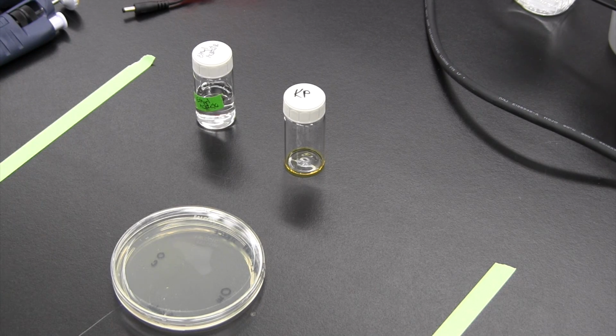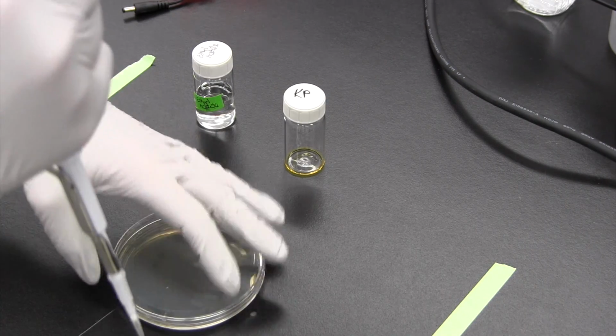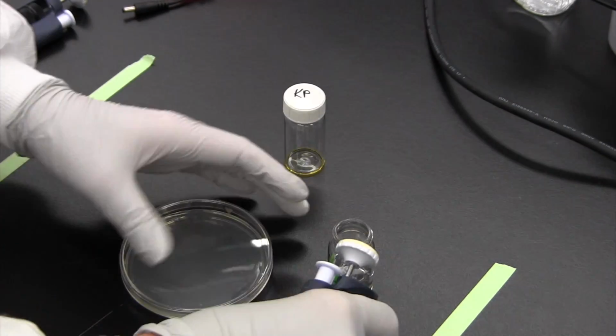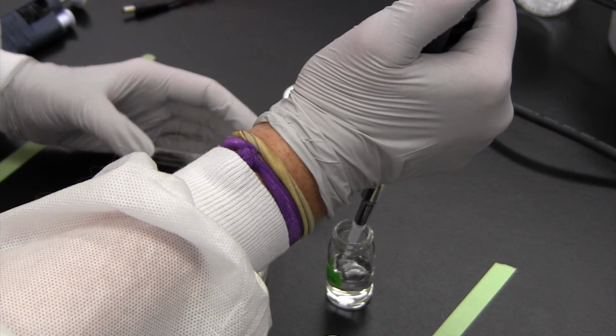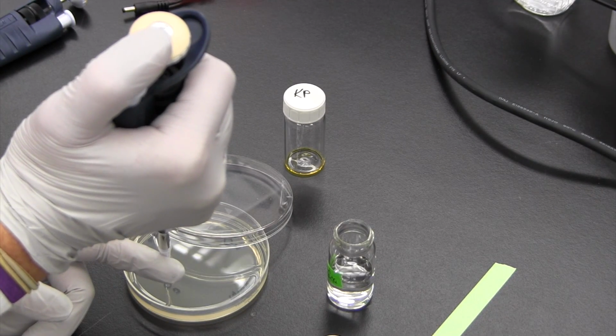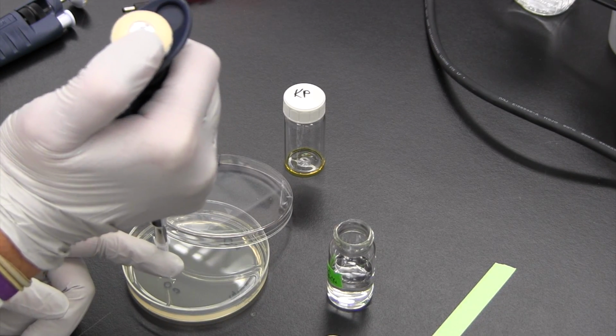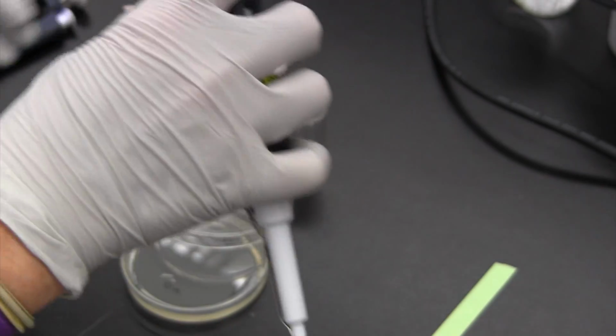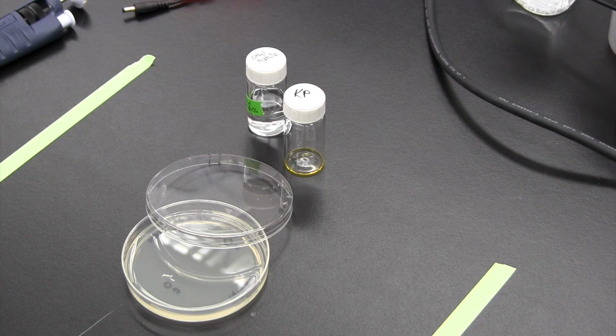I'll just walk you through that process. I have a pipette set to 10 microliters. I'm going to take 10 microliters of my ethyl acetate and dot this into my control. You want to be sure to not leave the ethyl acetate open for very long if you're not using it. And we're just going to let that evaporate off.